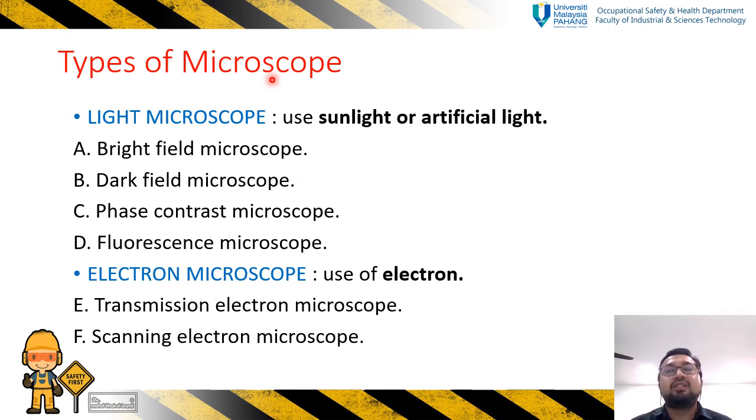But when we enter university, there are different microorganisms which we want to look at with better resolution, to see more clearly, so we must use different microscopes suited to the characteristics of the microorganism. Taking advantage of the characteristics of the microorganism, by using different types of microscope we can see more clearly. Right? And that is light microscope. Another one is the electron microscope. It uses electrons, which is more sophisticated and gives more detail. We have two types, transmission electron microscope and scanning electron microscope. We will go through the details one by one.